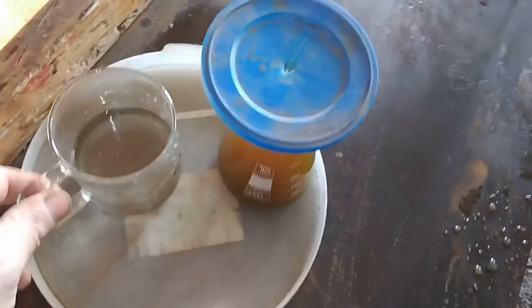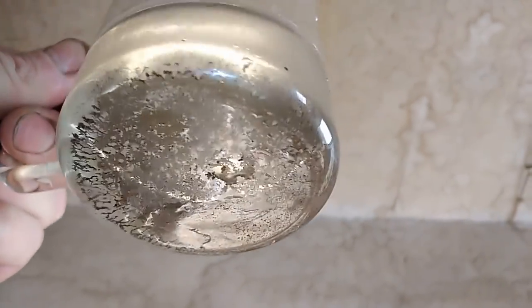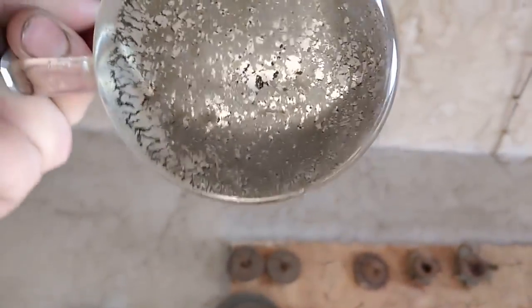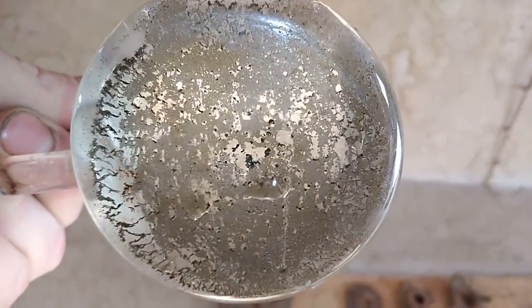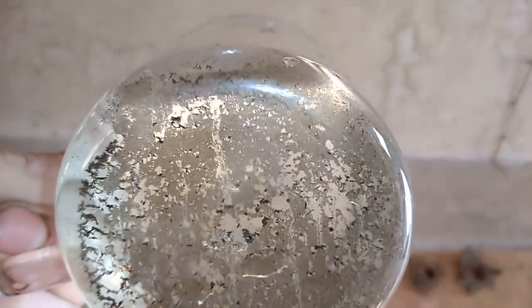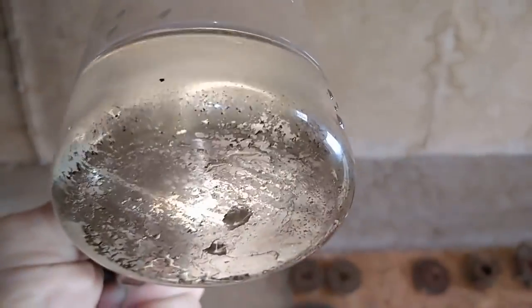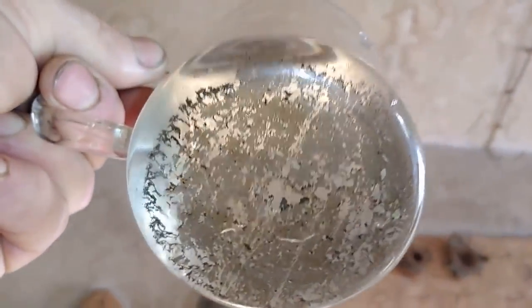Okay guys, so this is after a second refine and you see not too much gold there, but I got very heavy gold — very heavy. Just not too much gold there, but never mind, I will collect that, dry that and see how much weight we got from these small ceramic items.